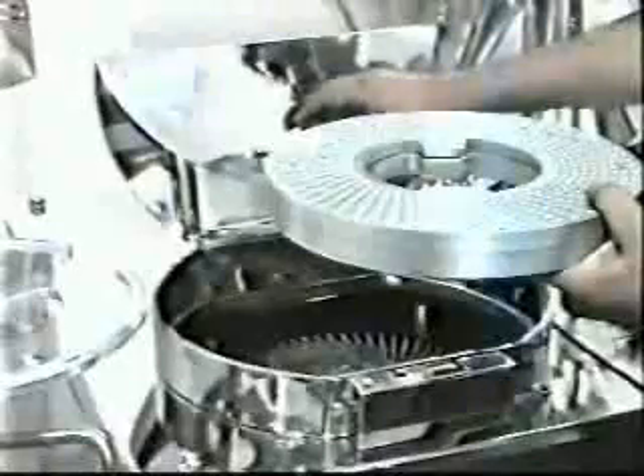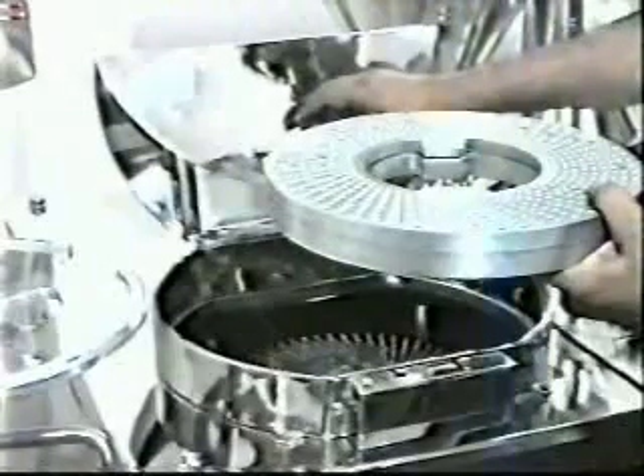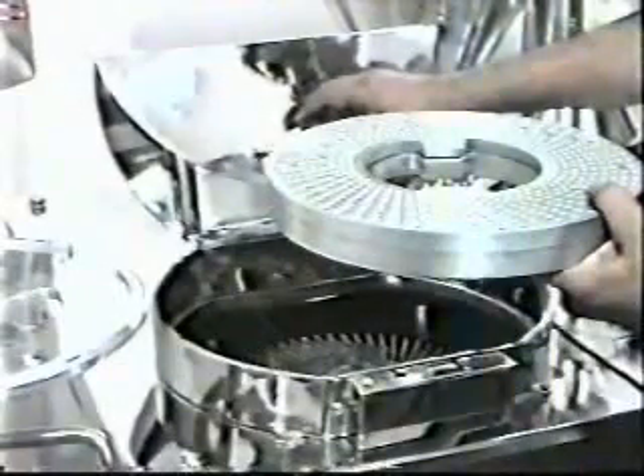The cap ring is then placed over the body ring, and the ring set is removed from the turntable and placed on the closing station where the capsule caps and bodies are rejoined.